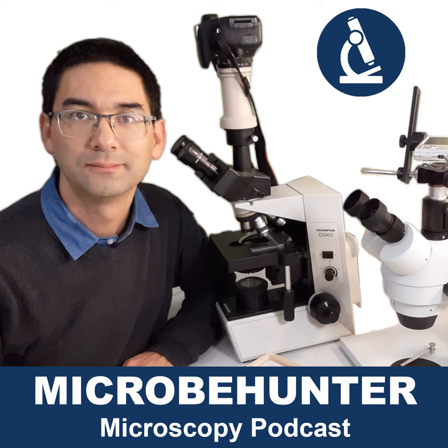Mistake number 3, starting to observe with the condenser all open. Basically, it's like this. When you start to find the focus of a specimen using the low power objective, close the condenser all the way. The reason is that this gives you not only the highest contrast, but also the largest depth of field. The resolution might be lower, but that's okay.